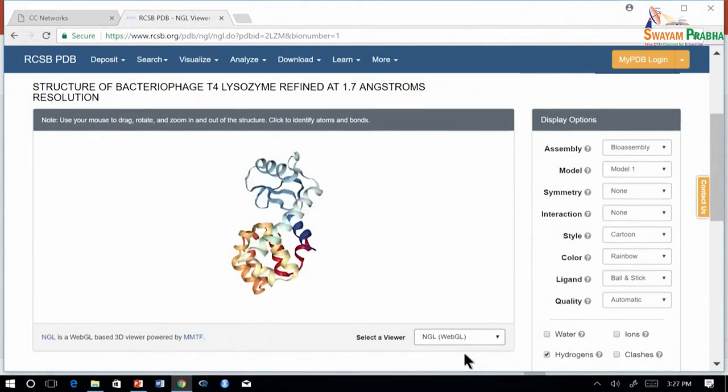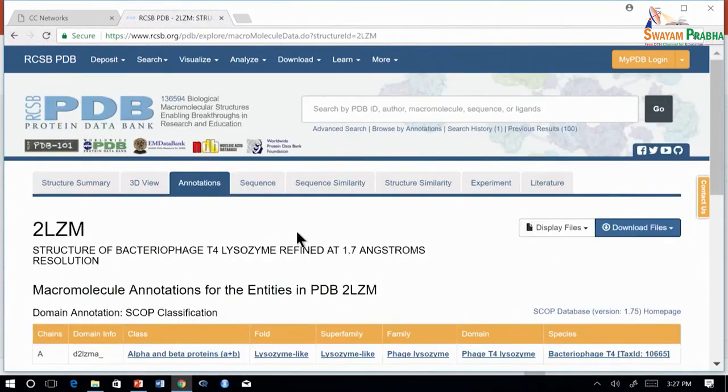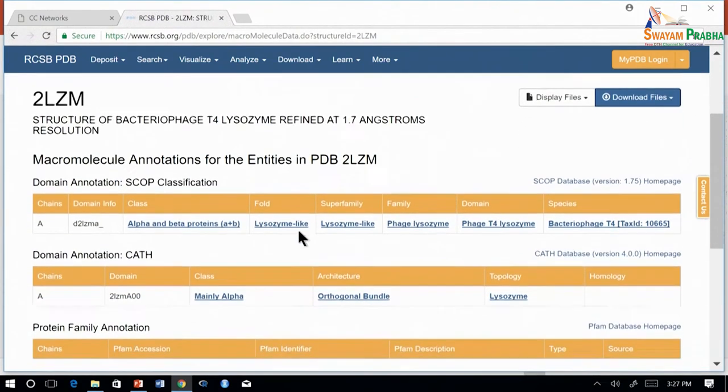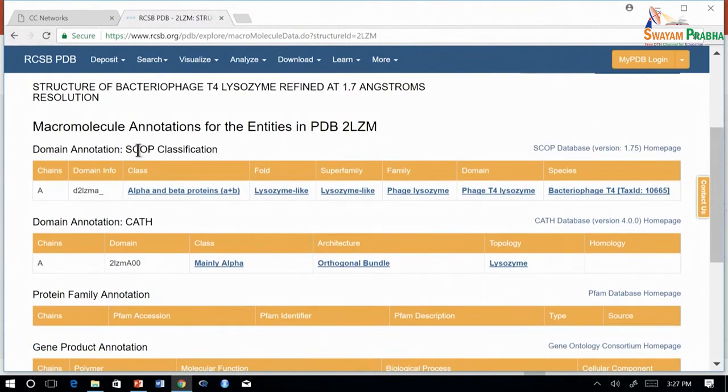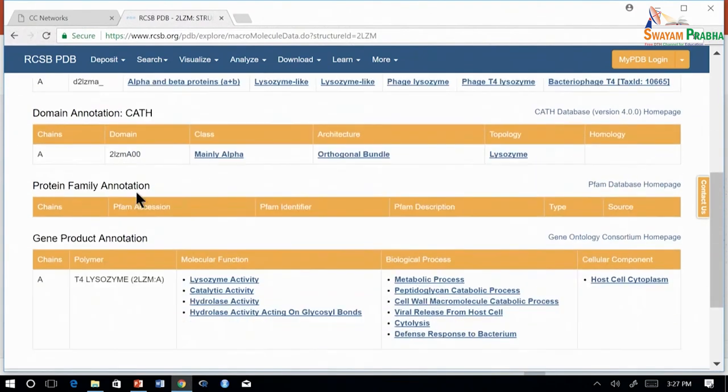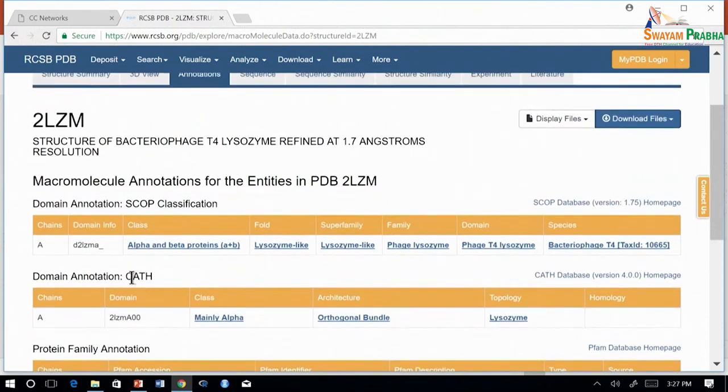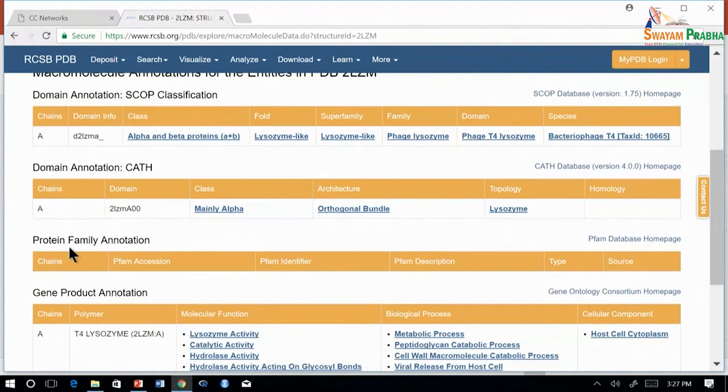We will move on to annotations. For this entry we have annotations from SCOP, CATH, PFAM, as well as gene product annotations. SCOP and CATH give an idea about the protein class which 2LZM belongs to, and PFAM as well.